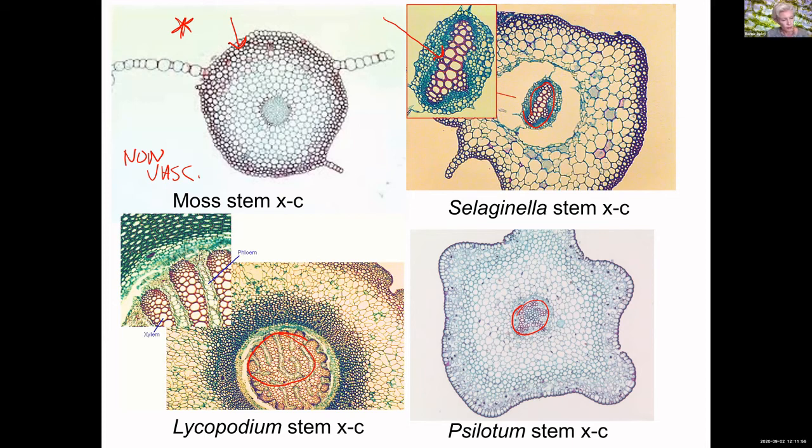All right, so we have three different kinds of cells that we find in the tissues of plants, and I'm briefly going to tell you what they are right now because it helps us identify different types of tissues. These really open, plain, boring looking cells that are part of the ground tissue are called parenchyma.